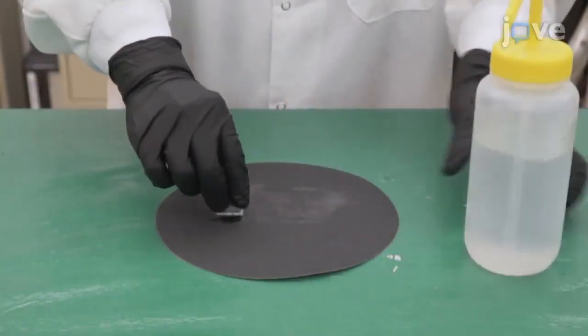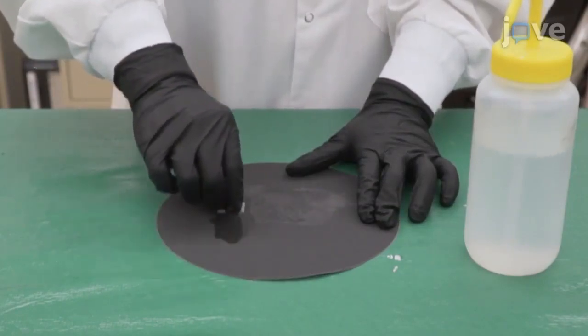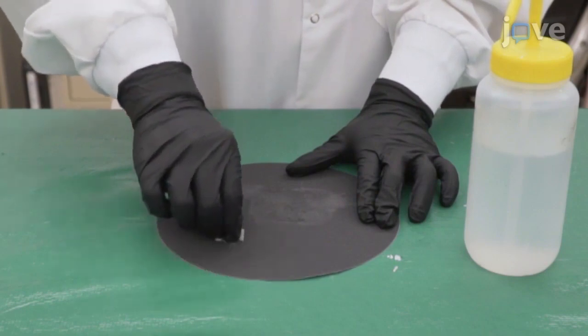Using 180 grit sandpaper, mechanically grind one side of each sample for 30 seconds along one arbitrary direction.